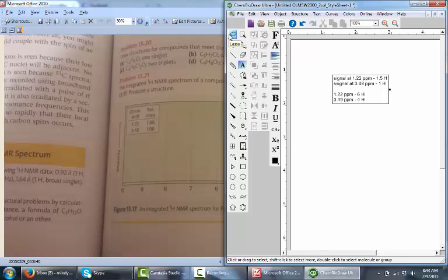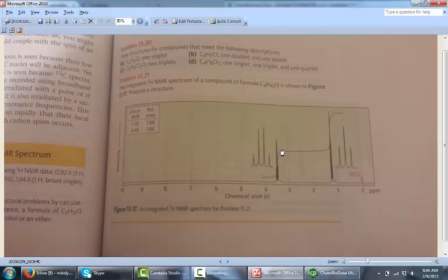So it's clear, the first thing we can see is that this molecule must be very symmetrical to have only 2 types of protons, despite the fact that there are 10 of them in the structure. I'm just going to redraw the molecular formula here as C4H10O. Now let's look closer at what the proton NMR signals actually look like.